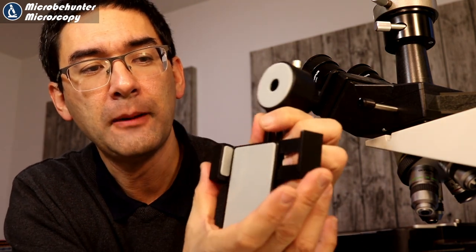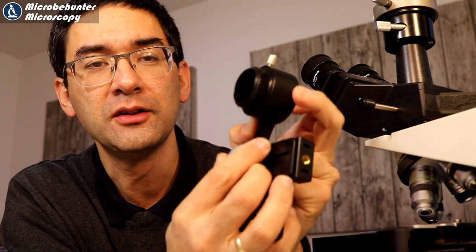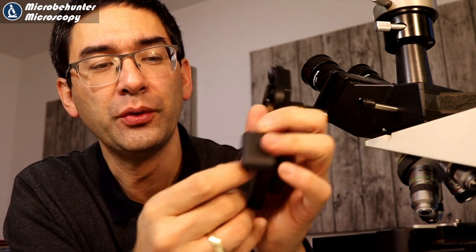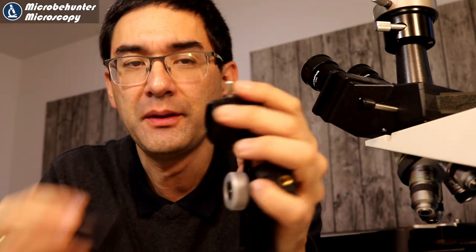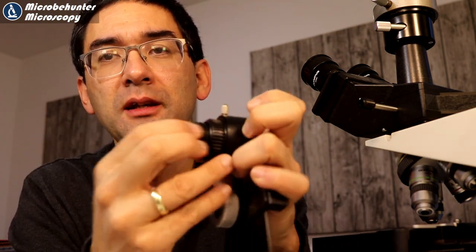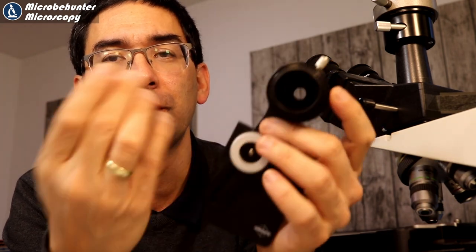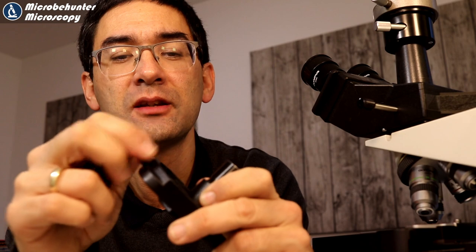One difference is how they're held in place: here there is a spring, while this one does not have a spring - you have to adjust the size of the adapter so that it fits the mobile phone, and then tighten the screw in the back. I don't think it's a major issue, but if you're concerned that the pressure is too high, this one gives you more control over how tight it should be. Concerning the eyepiece, there is a little screw up here. When you tighten it you'll see it does not fit, because the diameter is too large - there are actually different sizes of this adapter available for different size eyepieces, which is something to take into consideration.